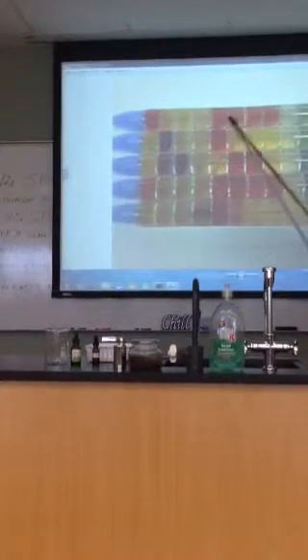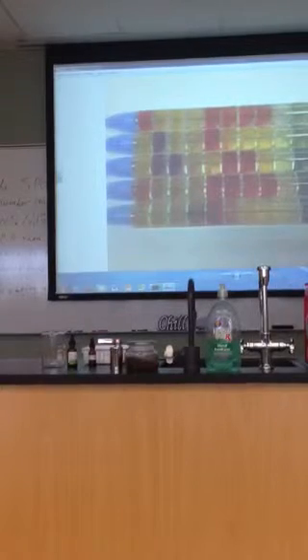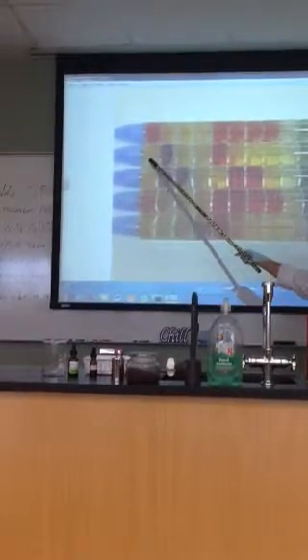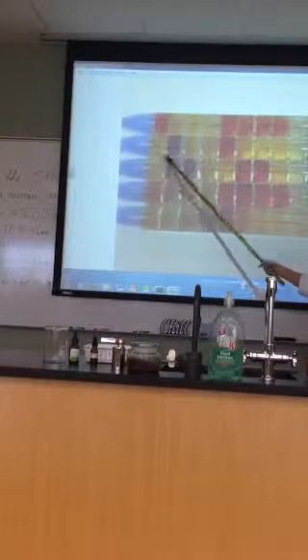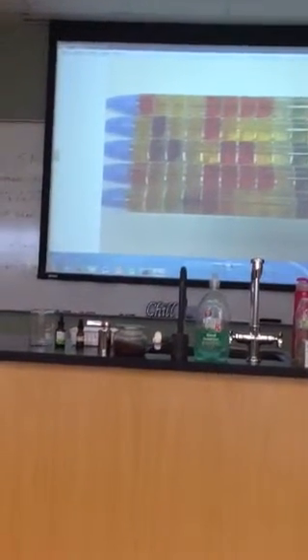This one up here is an uninoculated control. So that's how it starts out. This one is E. coli. E. coli ferments glucose. See the color change? It's a facultative anaerobe. All Enterobacteriaceae are glycolytic. They ferment glucose. This is Serratia. Ferments glucose also. This is Citrobacter. Ferments glucose also. All Enterobacteriaceae ferment glucose.